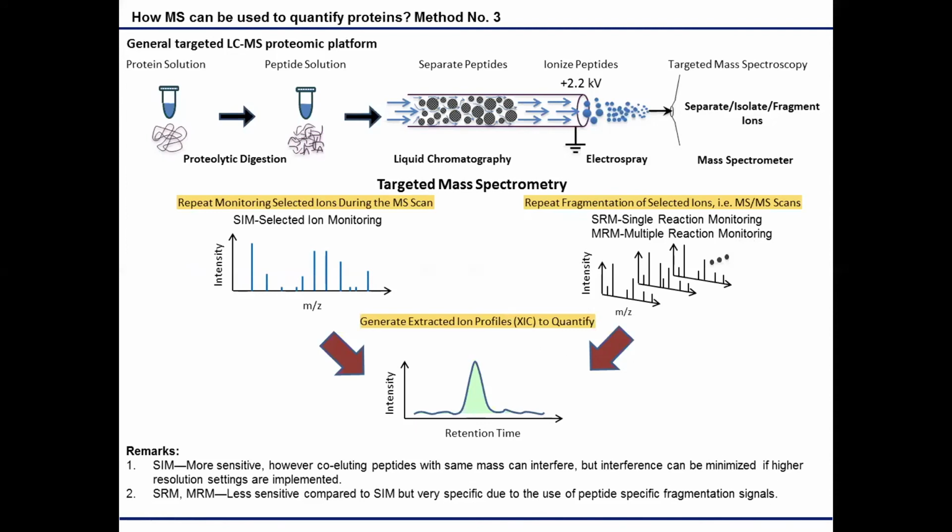Okay. But I would like to mention here, you did a really nice job walking through that. But if everybody just takes a minute to notice the y-axis on all of these graphs, when you do mass spectrometry and you're focusing on measuring the m/z values, you get an intensity value. The intensity value is typically representing the total number of ions. And so that's really where we get this information.